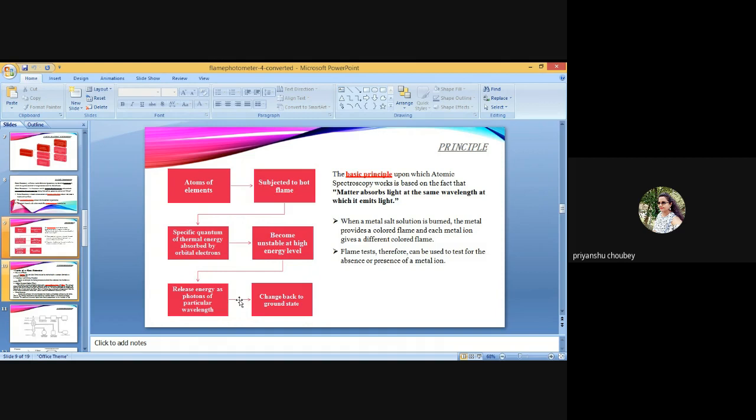Microprocessors are used for the automatic control of the instrument component setup, the optimization of required operational parameters, instrument calibrations and manipulations, and the storage of data through clear commands.